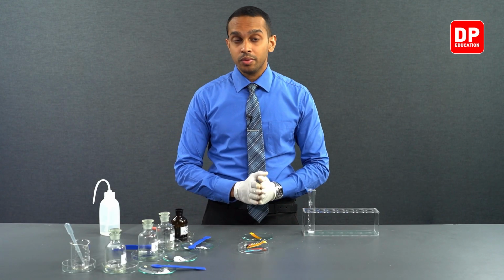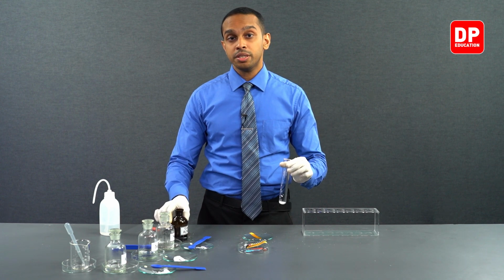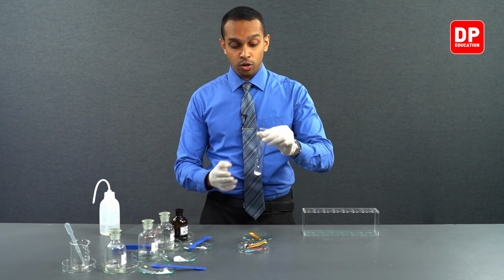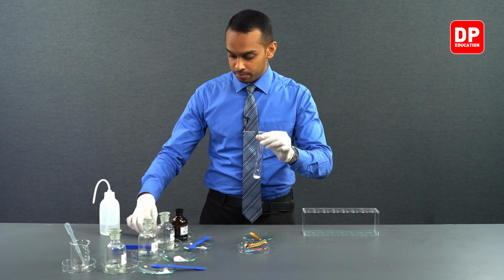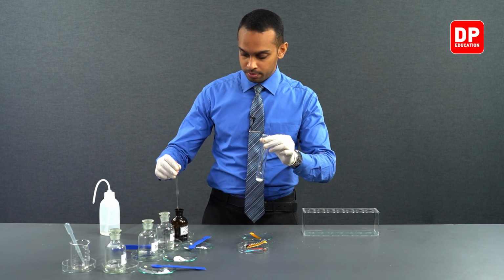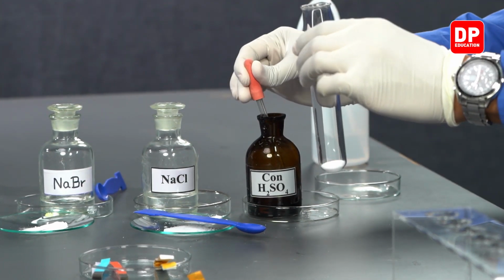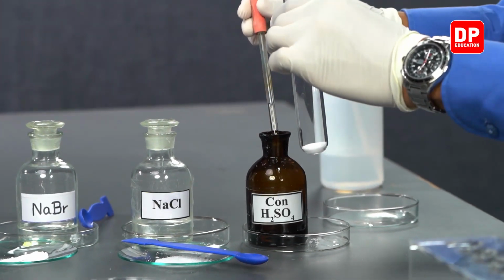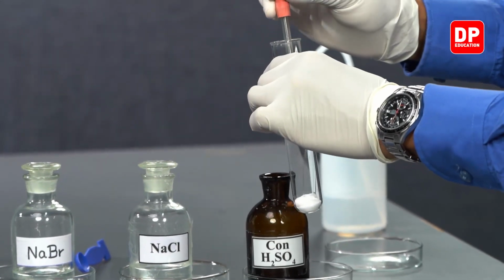So now let's add some concentrated sulfuric acid onto our sodium chloride solid. Now, as I mentioned earlier, upon addition of sulfuric acid to sodium chloride, you will see a gas evolving.